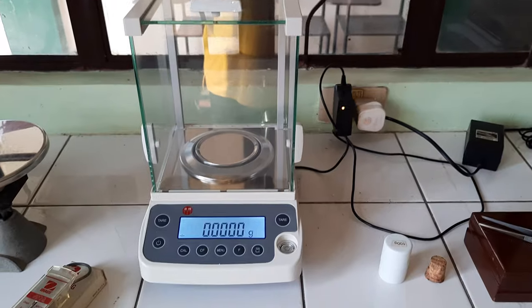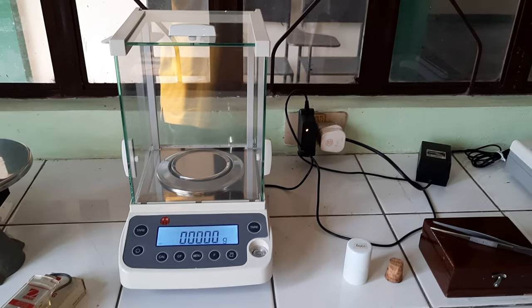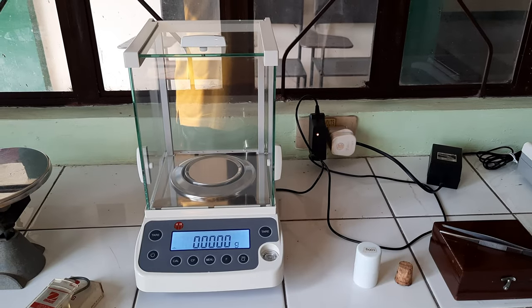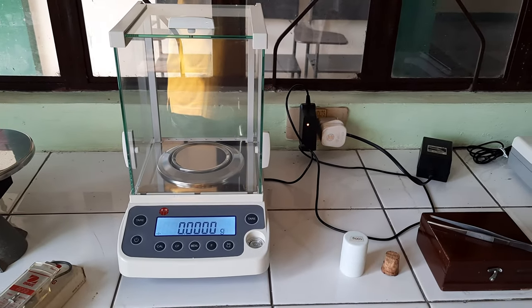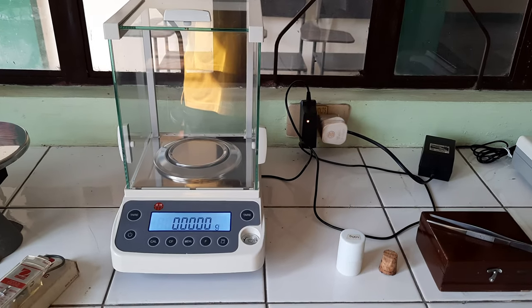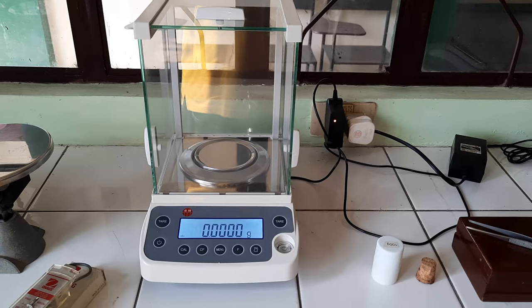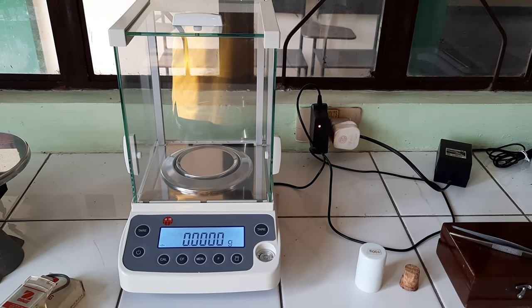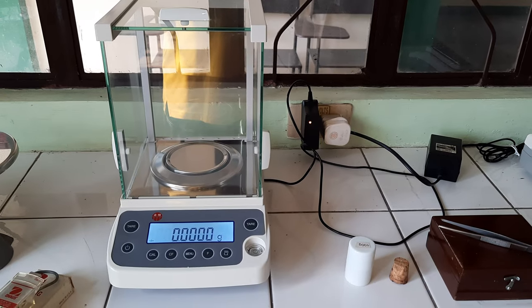We also have our analytical balance — a modern designed analytical balance which can be sensitive up to one-tenth of a milligram. It has four decimal places after the decimal point, which can be used to determine very minute mass quantities of substances.